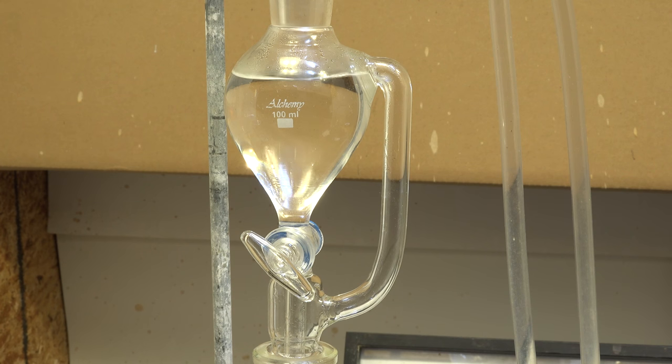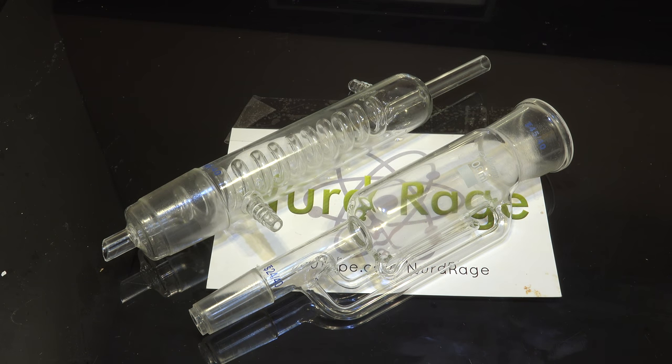And we can't keep it closed because the solvent at the bottom of the funnel will be stagnant and never get mixed with the solvent at the top if it constantly overflows. Overall, we get essentially the same function as a Soxhlet extractor. A way of keeping our chemicals soaking in solvent while at the same time removing the dissolved chemicals and replacing them with fresh solvent. It's not quite as fast as an actual Soxhlet extractor, but far cheaper. Especially since most labs already have these components. And there you have it, the Soxhlet extractor.